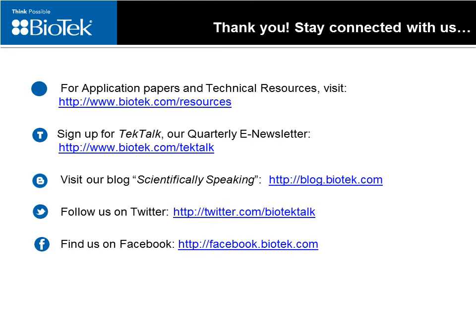Is the resolution high enough to count bacteria cells using the bright field application? Depending on the bacteria, you can certainly pick up bacteria. Depending on the exact setup, there might be varying degrees of effectiveness with extremely small objects. But it has been tested on smaller cell types as well.